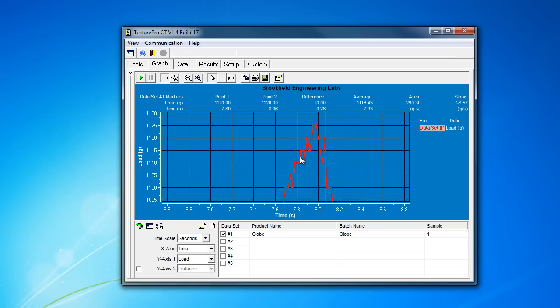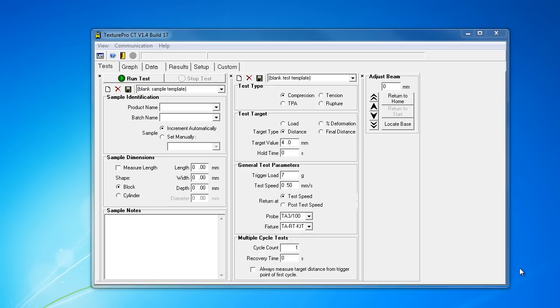If you want to do any customized calculation, any two points, you're going to have to manually select it each and every time for each replication. Let me show you one of my favorite features of this software.